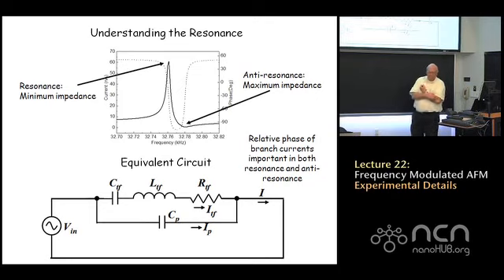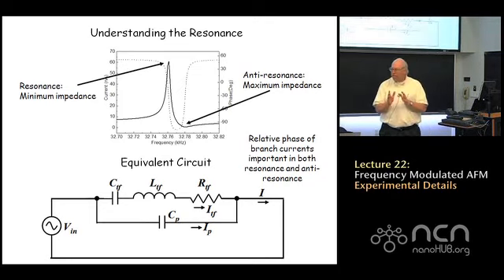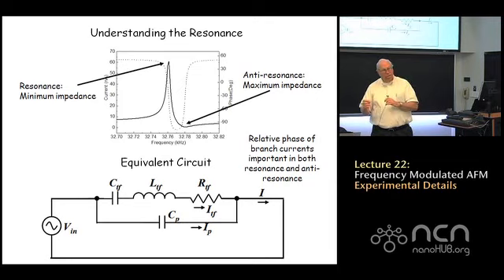The resonance that we measure experimentally is now no longer measured by a laser beam bounce technology. Another distinct advantage of these quartz tuning forks is you can throw away that laser diode. You can throw away the photodiode that collects the laser light that bounces off of a conventional silicon cantilever. You don't need that anymore.